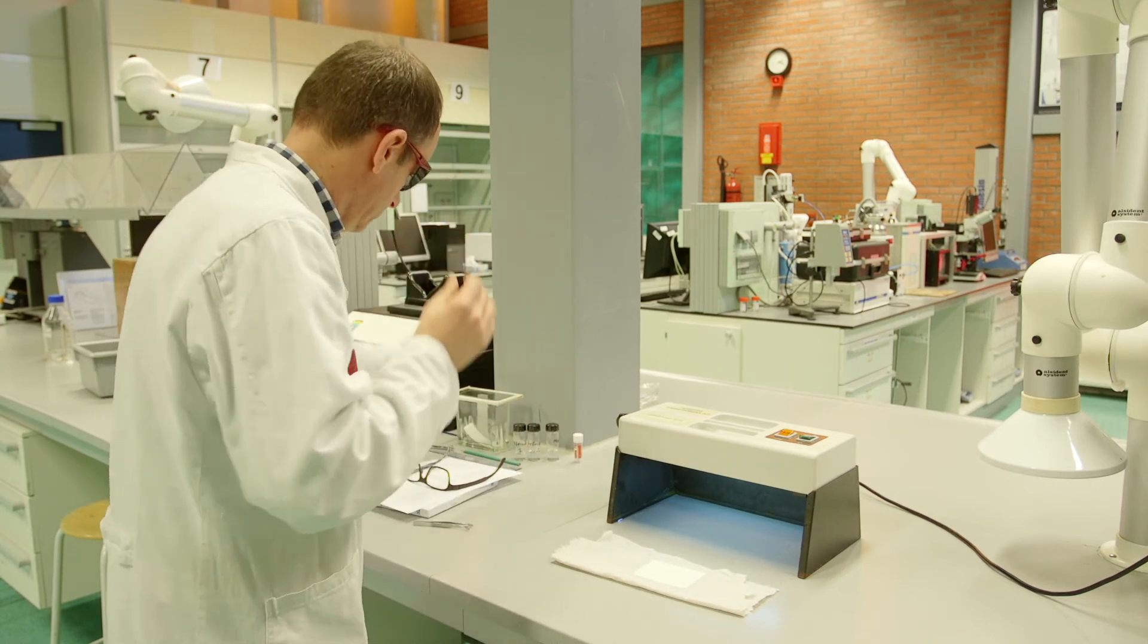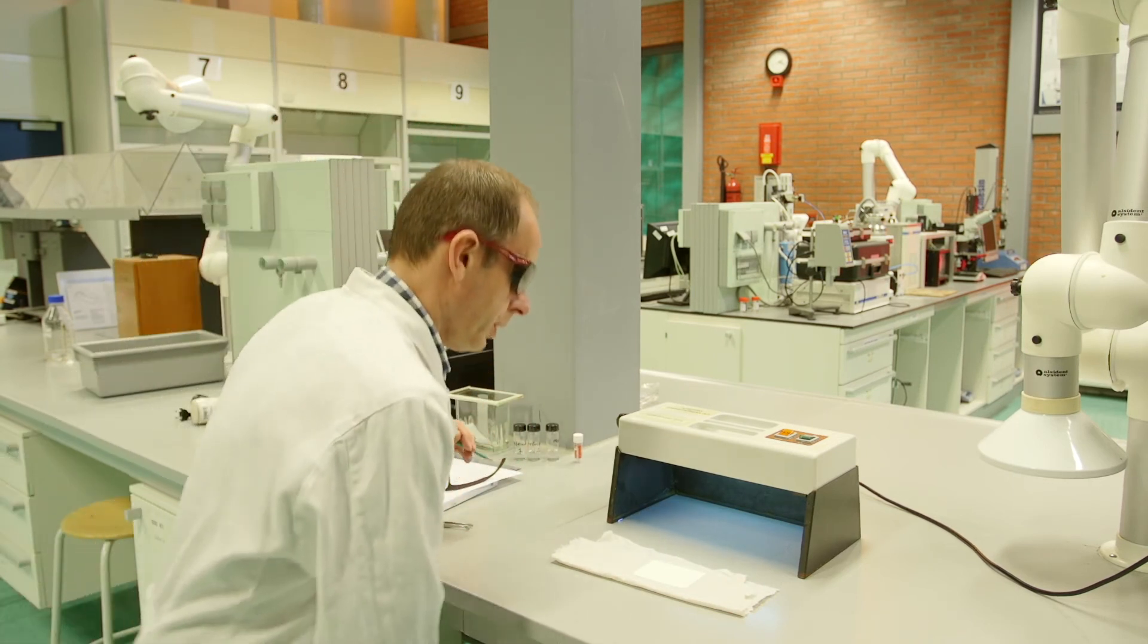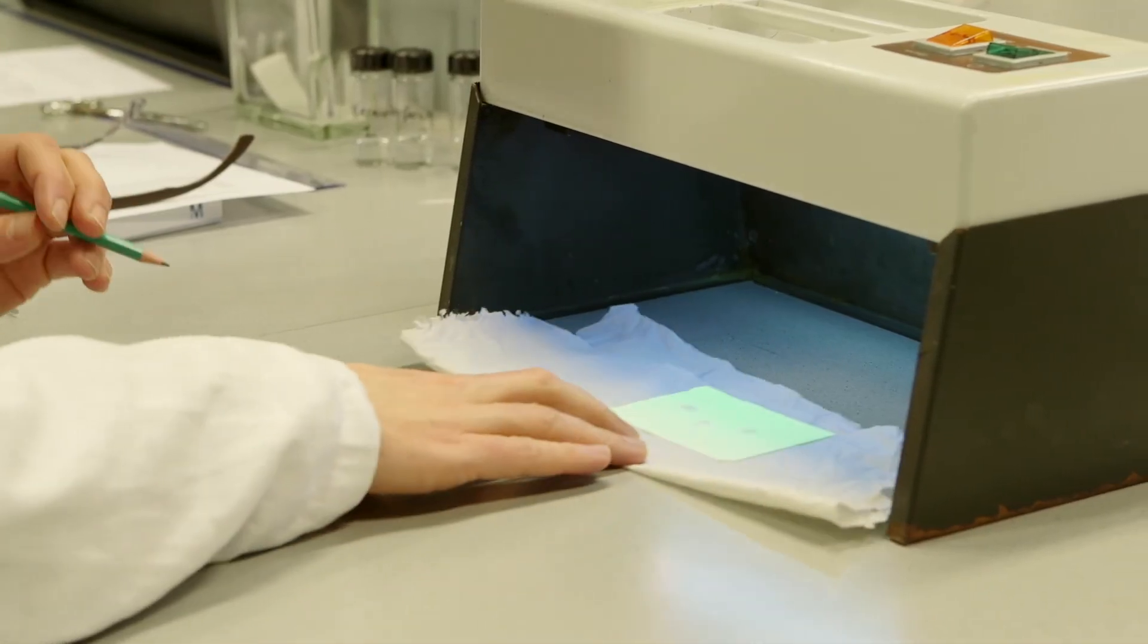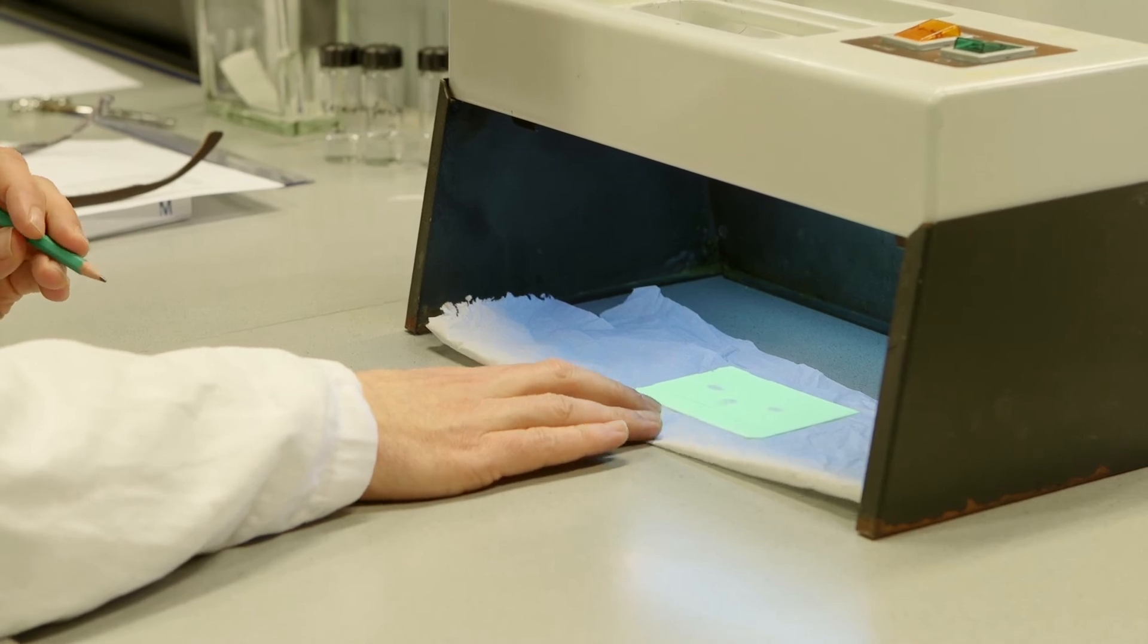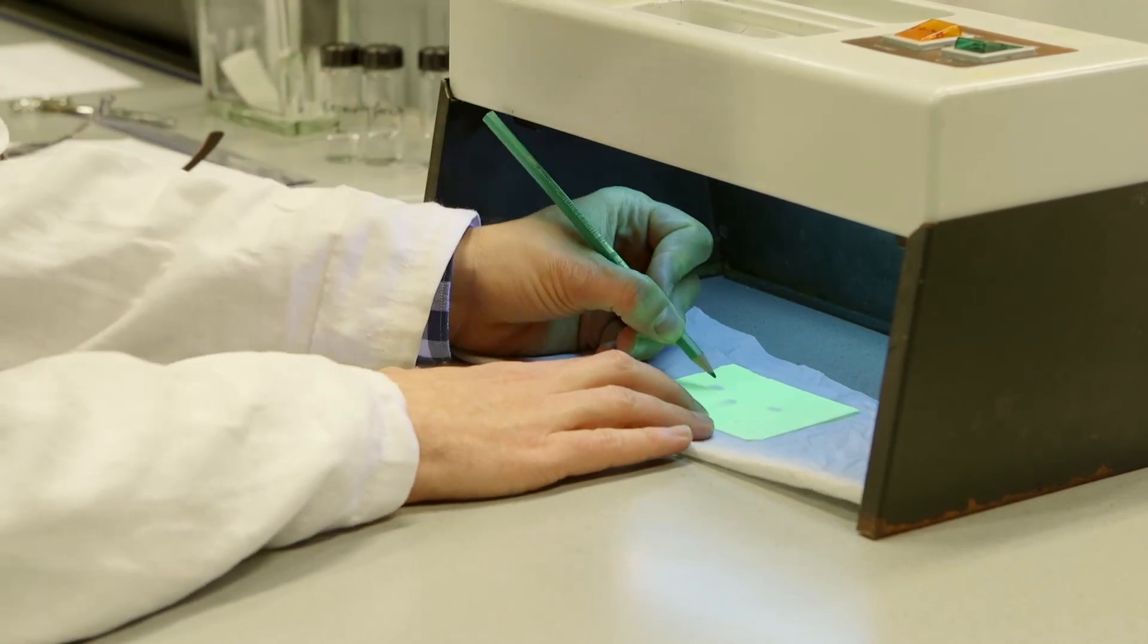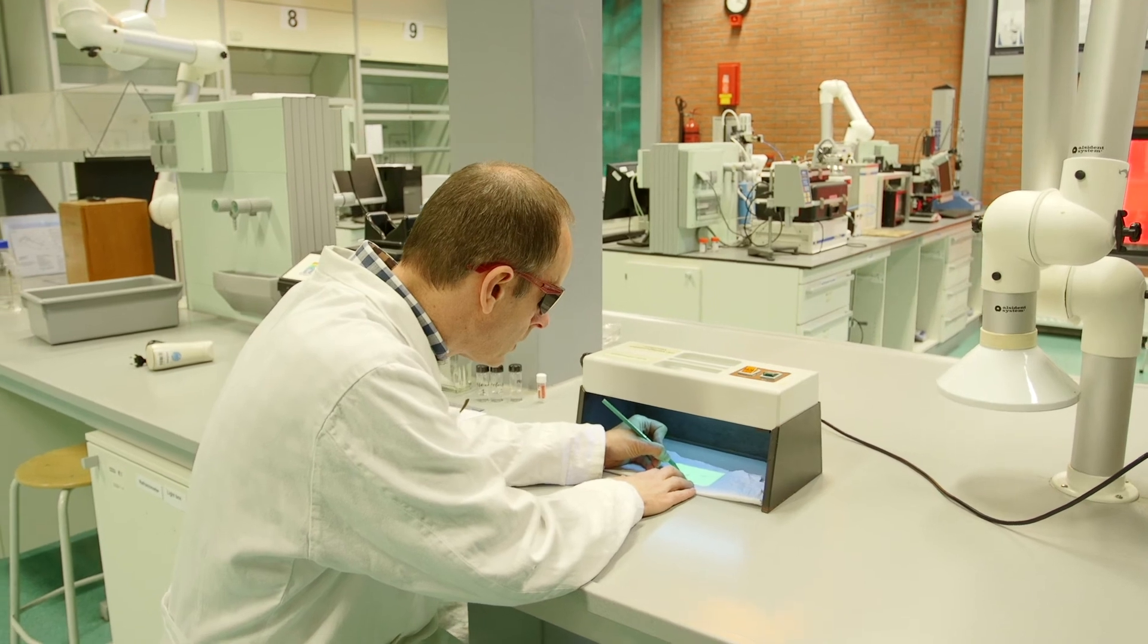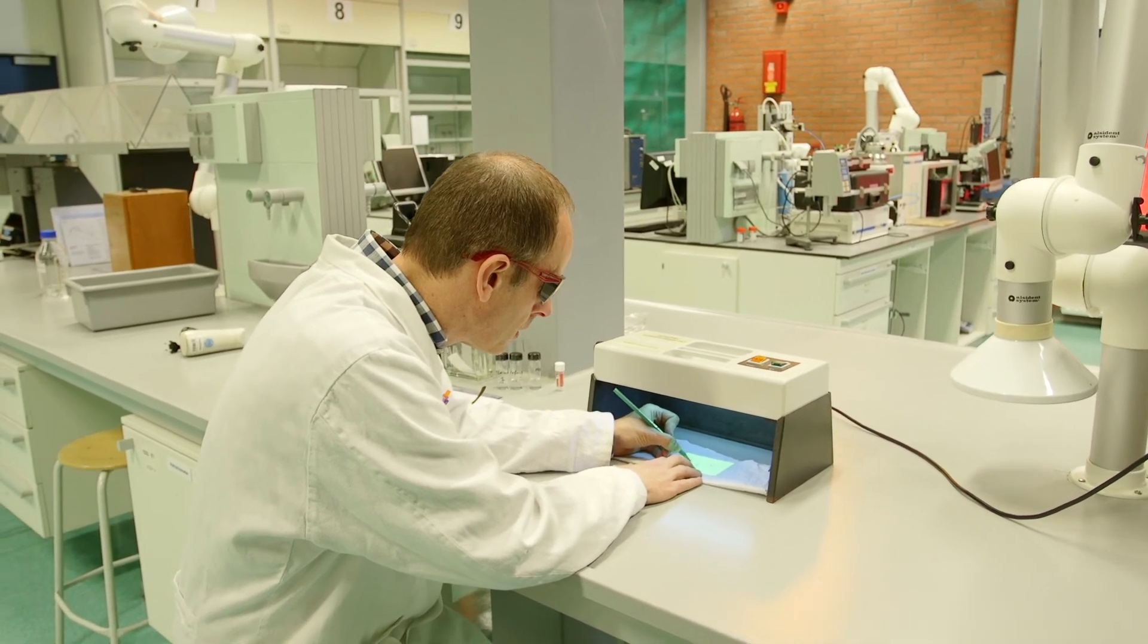After the separation, the components can be visualized in different ways. The first possibility is irradiating with UV light. Some substances exhibit fluorescence or a dark spot under UV radiation of a certain wavelength. In this method, the plate remains intact.